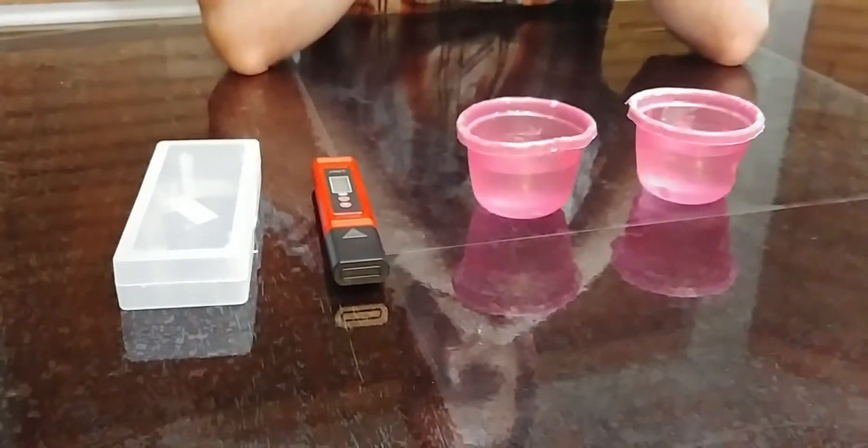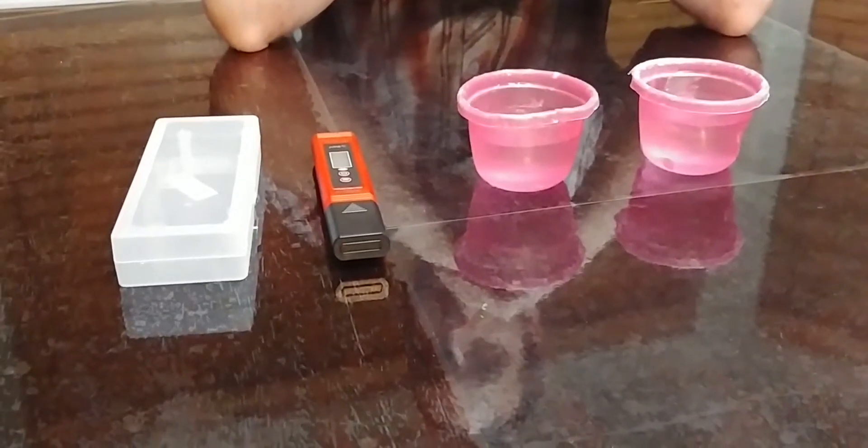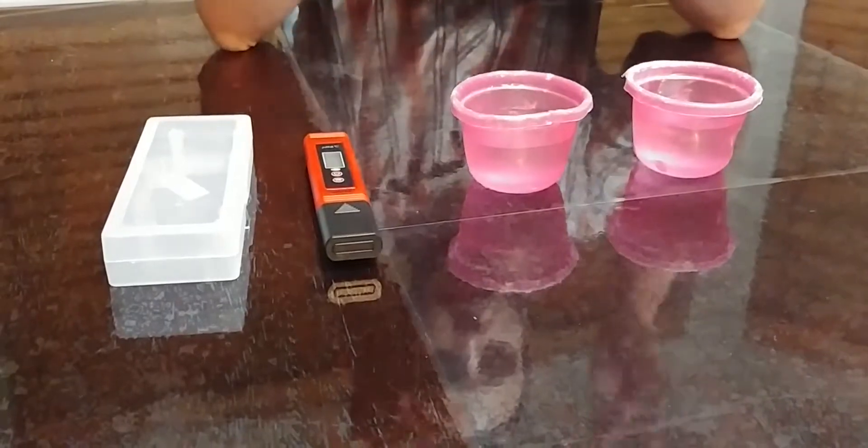Today we're going to be giving you a closer look at this pen type pH meter for measuring and testing water, or any other liquid.